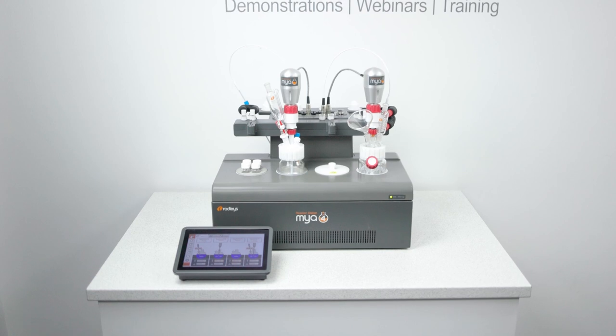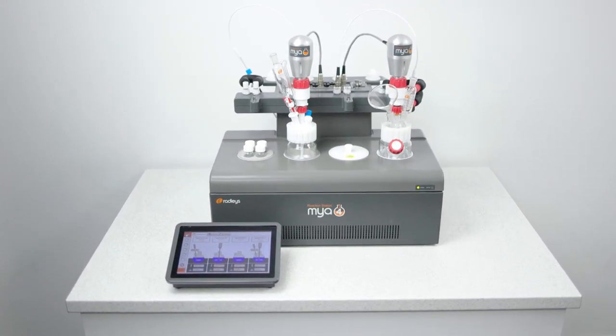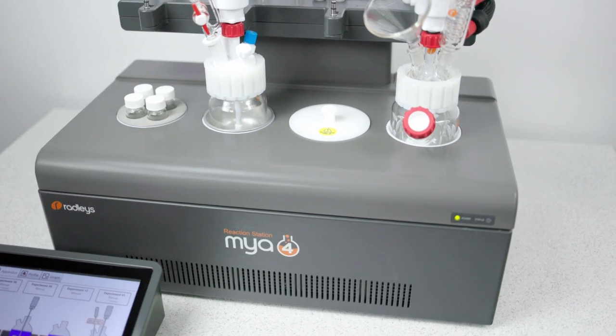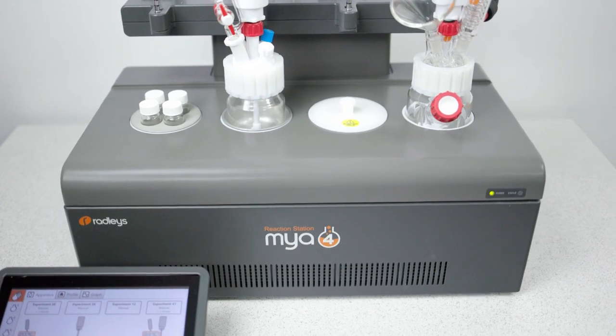Our new model keeps all the specifications and features that users love, but with updated looks. Due to its new fluoropolymer top coat, it will offer a more rugged design, especially for particularly aggressive chemical applications.